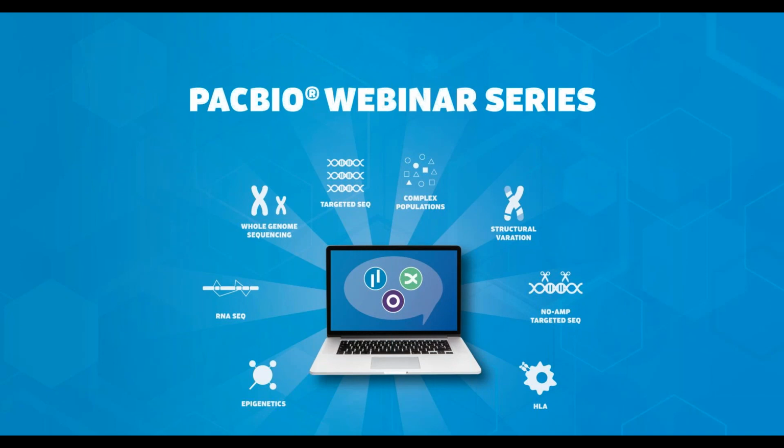Okay, thank you. So we'll have one last question for Sarah before we wrap up. How easy is it to prepare HiFi libraries compared to a CLR prep? We have a protocol that's released. Maybe when we release the webinar slides, we can include a link to the protocol. I haven't done it myself because I'm a bioinformatics scientist. Richard might know more about this than I do. I think it takes about a day and a half to do the prep.